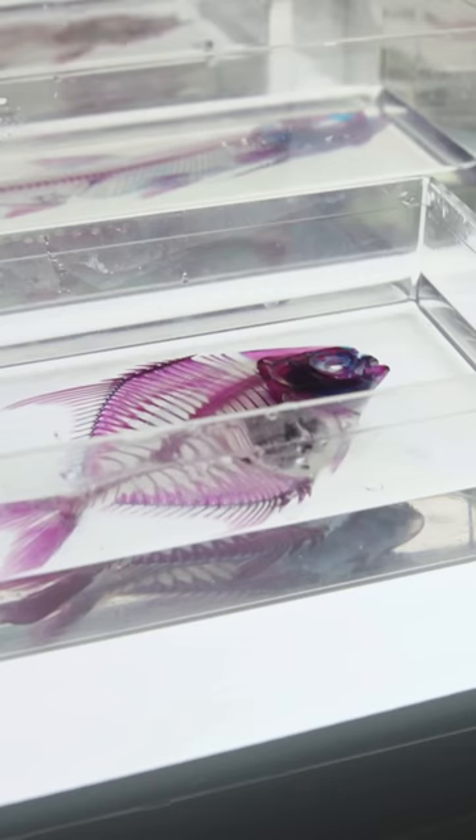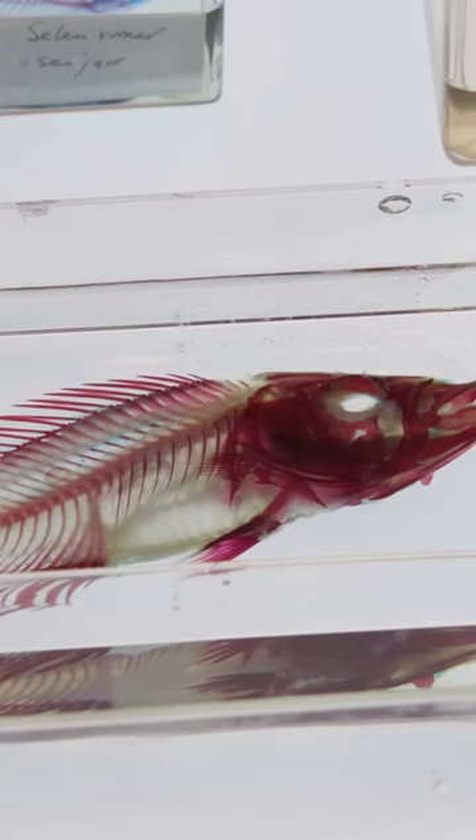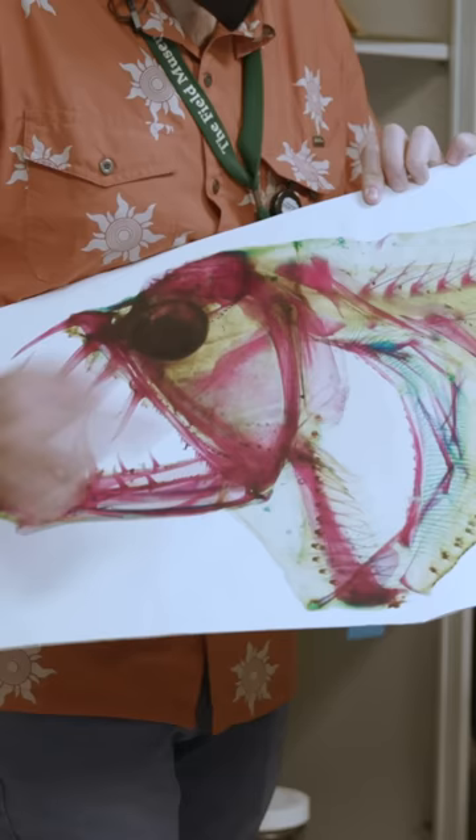The whole process can run a few days to around a month. You can put this under a microscope, move bones around, and see how one bone moving affects other bones nearby.